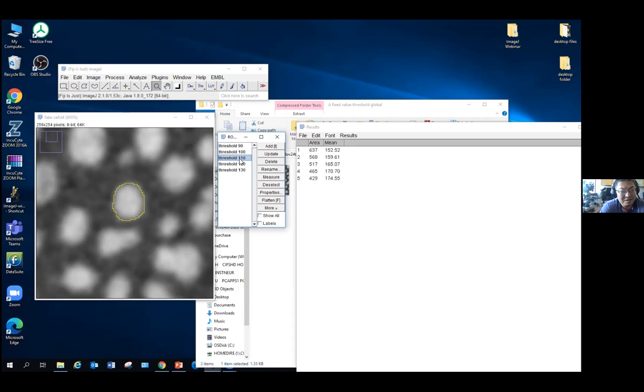So in that case, all this image analysis software provides a way so you don't need to manually apply the value. The program has different algorithms to calculate what the value can be.